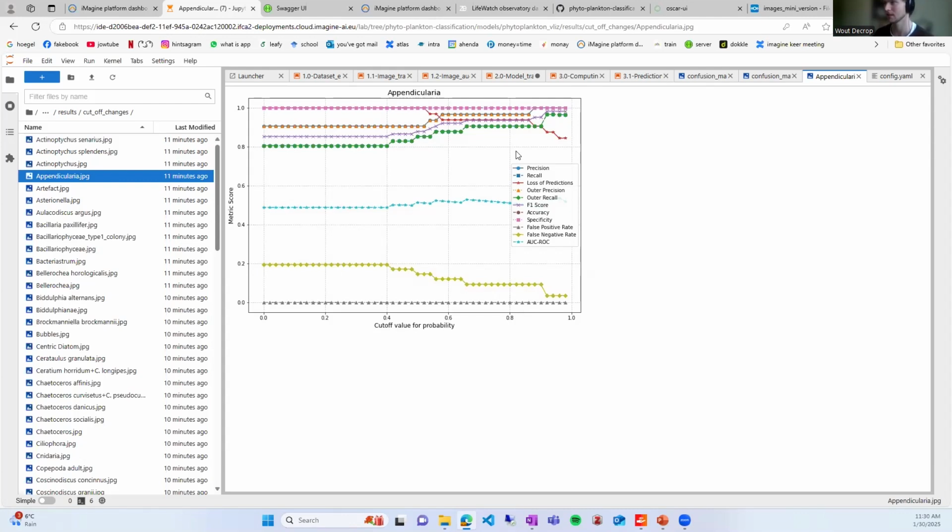So here you can see, of course, if you don't put any filter, we get 100% of the data, which is this red curve. But if you apply a filter and say you have to be at least 80% confident, we do get 10% of the data removed, because you have to look at this red curve here. So there's a 10% difference from the full.